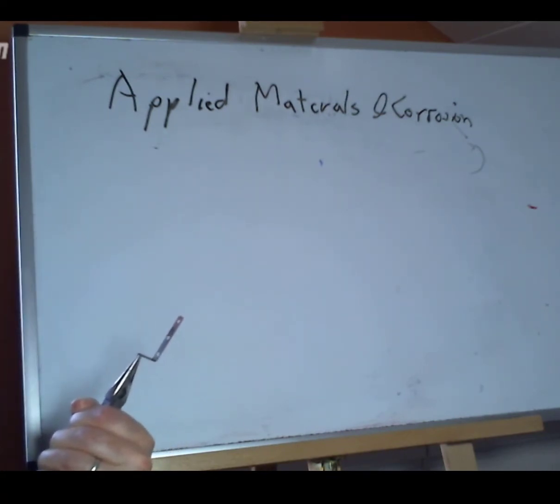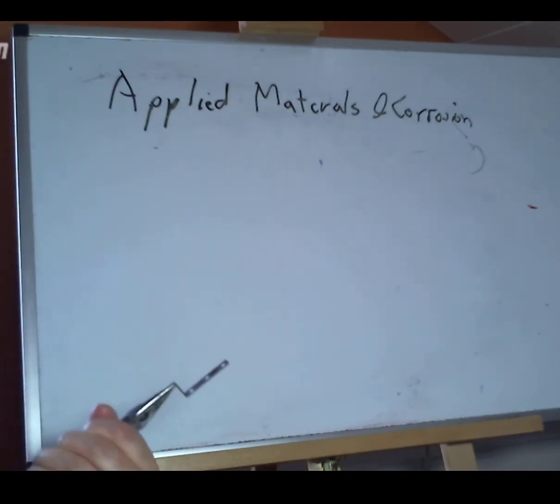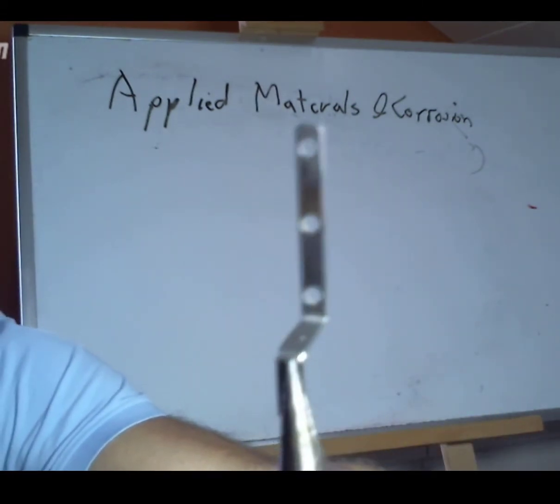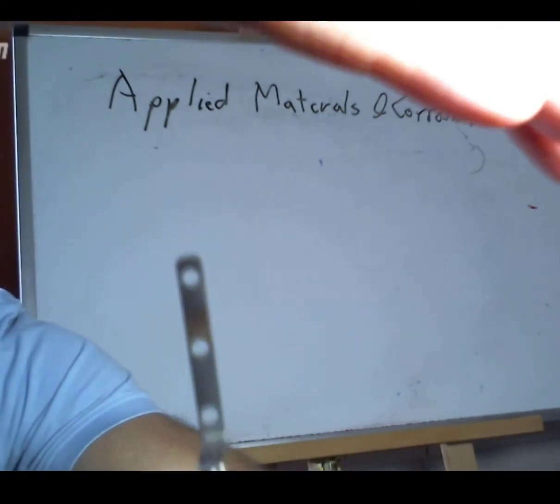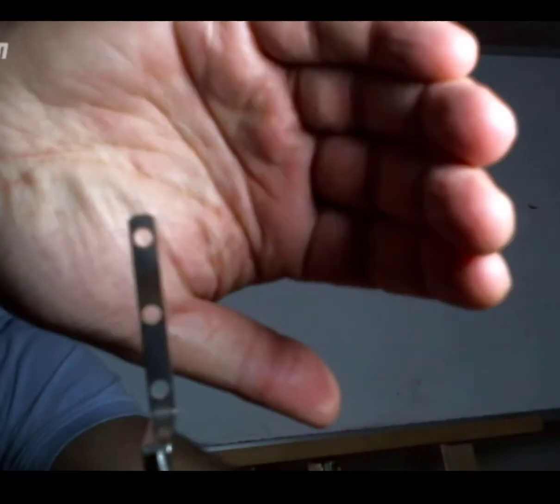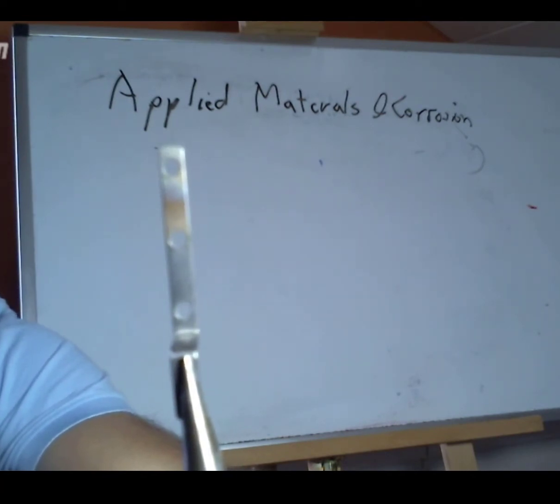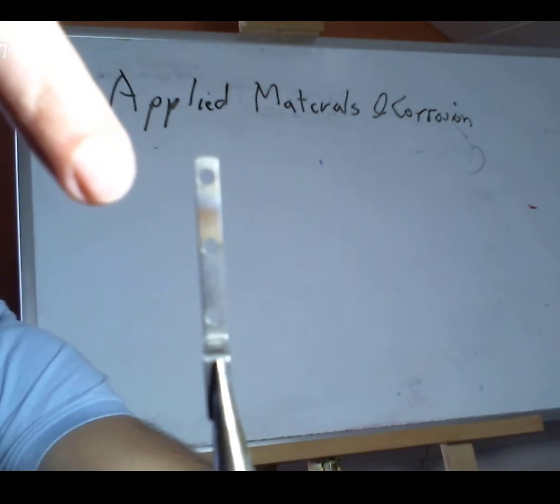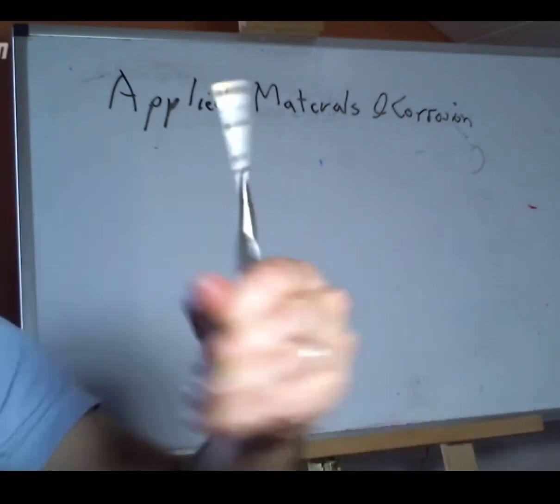We're going to let it cool down so that I don't burn myself, and move it up close to you. We're going to have to do something with the lighting. It's a bit difficult to get this to work. That's the best. So what you can see is what appears to be a lighter colour at the end, and then it goes blue, and then it's orange, and in between orangey, straw coloured, I think they call it.